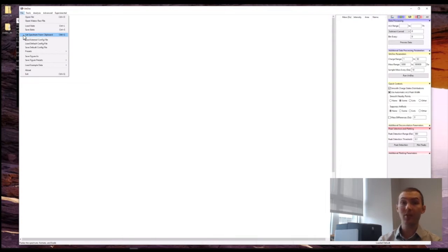With Thermo data, you need to install MSFileReader. With Waters data, you need to download the Waters MassLynx DLLs. And more information is on the UniDec website on how to find that. You can also email me to get more information. Today I'm just going to show you some example data. So we've loaded some example data in. These are present as text files.